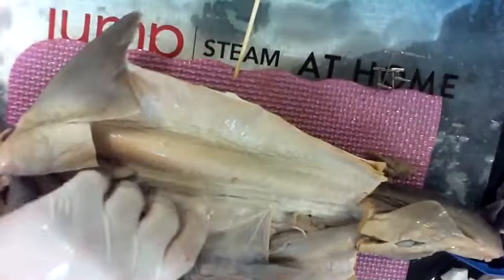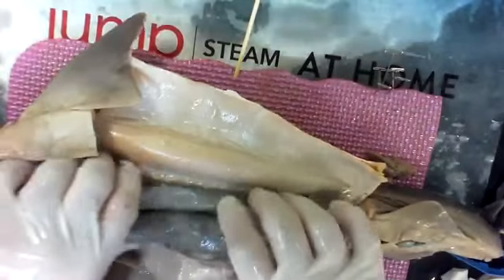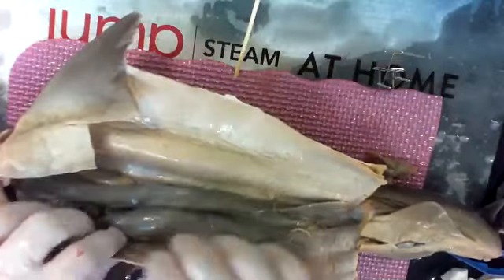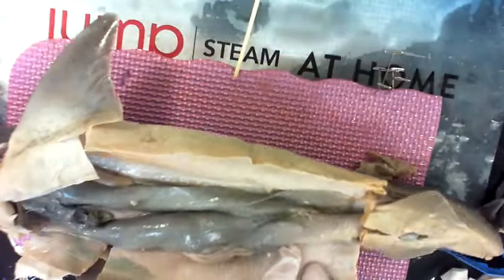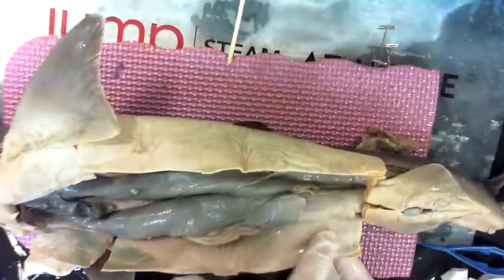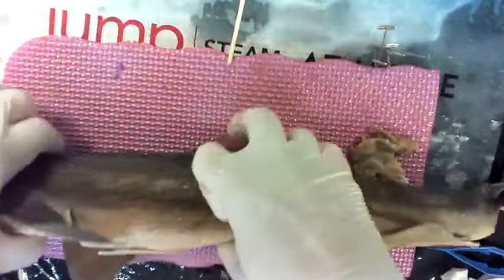I'm the same way with anything that I dissect. Because even though we think, well, you know, people eat sharks or people catch sharks for whatever reason, we learned from the shark, so I'm showing it respect. Putting everything back in, closing it back up. You can go through later and dissect if you want and look at the muscle groups. You could dissect out these blood vessels. Oops. Like there's the vessel here, there's another vessel, 2 lateral vessels. Just for fun if you want to. I'm going to close this back up. I'm going to flip my shark.